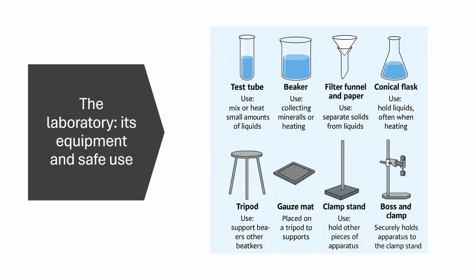So Year 9, when you come to high school and go to the science lab, you will see lots of equipment. In this video I am going to show some of the basic instruments you will see in the lab and how we draw them in a scientific way. Everybody knows the first piece of equipment, the test tube.